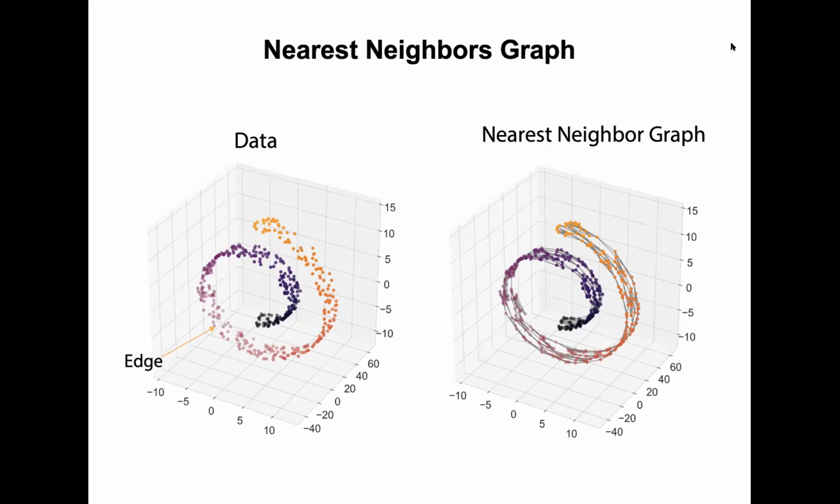Sure. Somebody asked in Slack, how about features? Do we assume to include all genes in practice when we build our graph? That's actually a really excellent question. No, you don't have to use every gene. That's up to you how you determine the distance. Sometimes we're only interested in looking at certain processes. For example, TA Arthi has been looking at some cancer data, and she's specifically interested in metastasis, so she subsets to those genes. If you felt like some of your gene measurements weren't good, or you don't want to regard them, you can take them out.